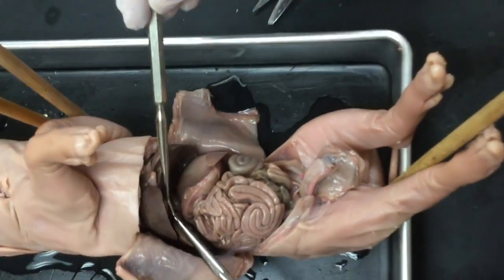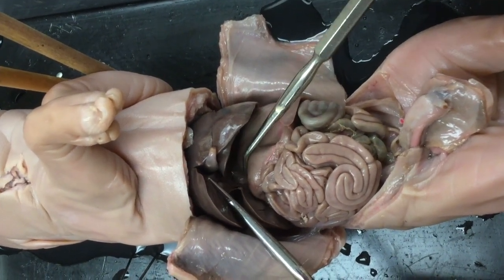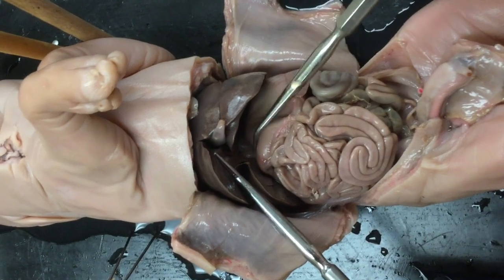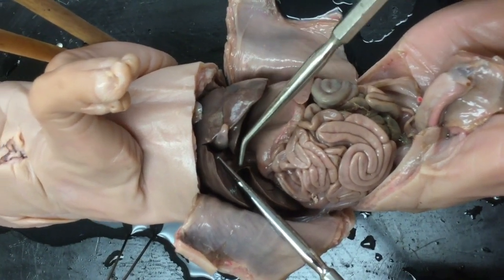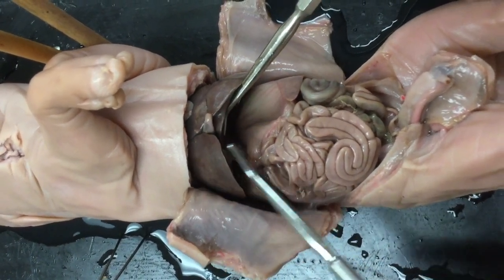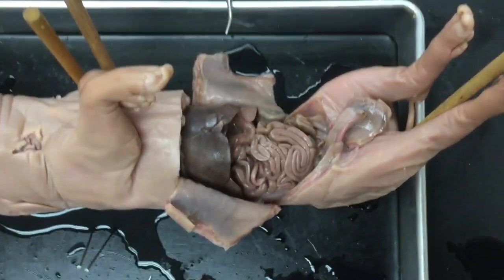You have a hepatic duct going up into the liver and a cystic duct going up into the gallbladder. Where those two ducts meet is the common bile duct. The gallbladder is responsible for storing bile, which the liver produces. Bile helps us emulsify and break down fats, and it travels into the small intestine via the common bile duct, where it deposits its contents.